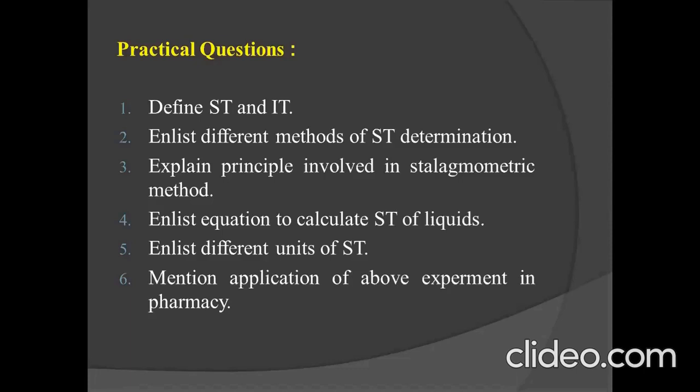So this is a very simple experiment for determination of surface tension. Now we will see the demonstration part of the same.